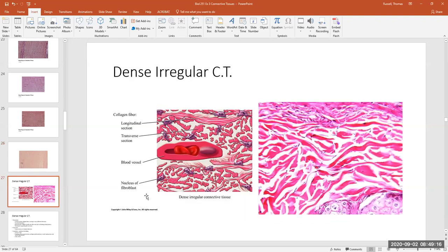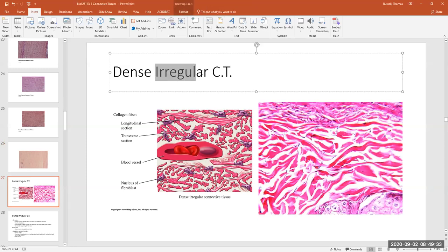Let's move into dense irregular connective tissue. It's still a dense connective tissue — called dense because there's a whole bunch of collagen fibers densely packed together. It's called irregular because the collagen fibers don't have a regular pattern — some run in this direction, some that direction, some behind and out of the plane. In all directions these collagen fibers are running.